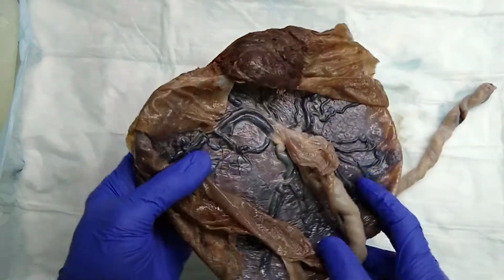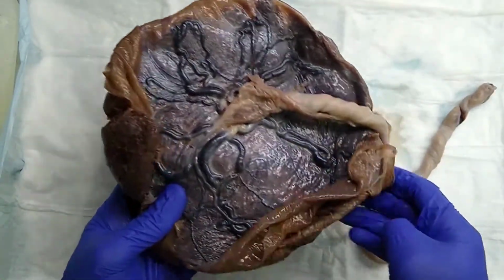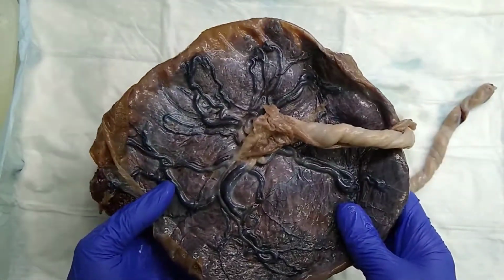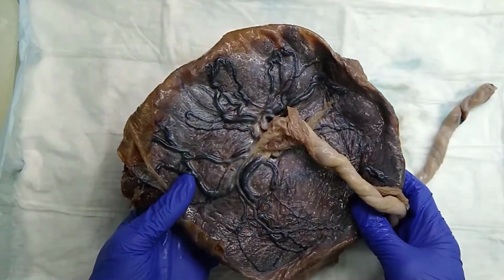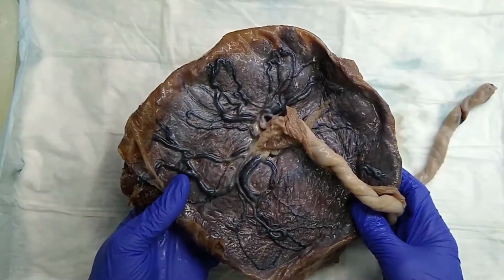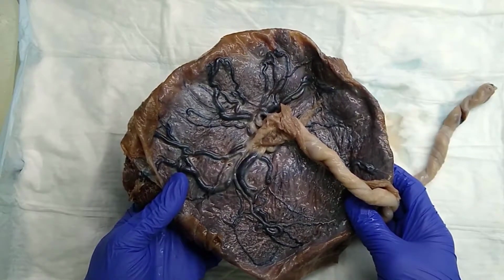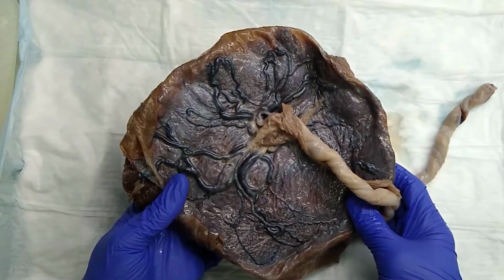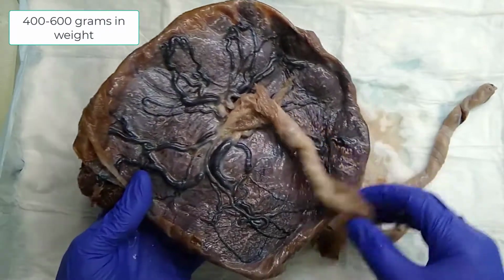Today we're going to review a normal placenta to orient you to subsequent videos about abnormal placentas. So a normal placenta, this is from a term pregnancy, which generally is 37 to 41 weeks gestational age. A normal placenta in that range is from 400 to 600 grams.